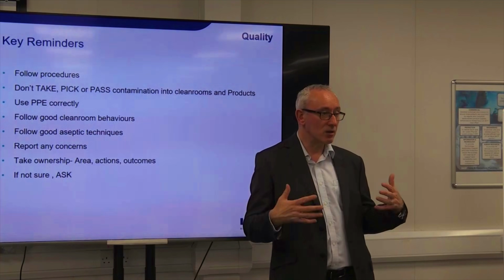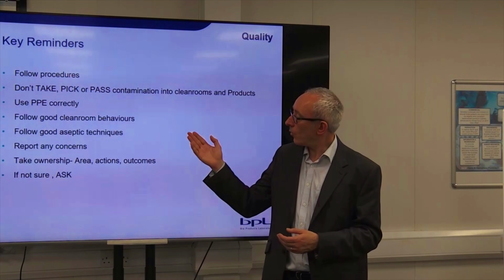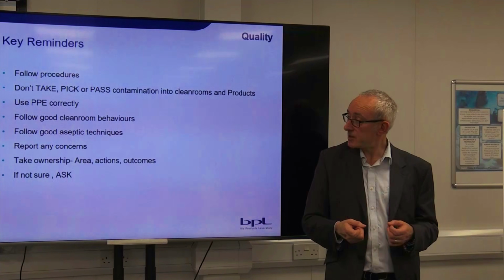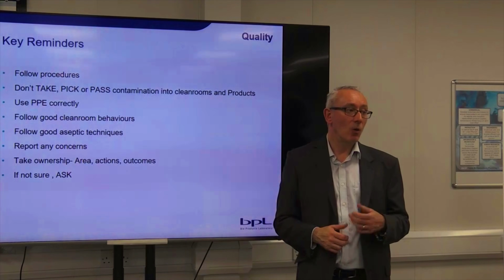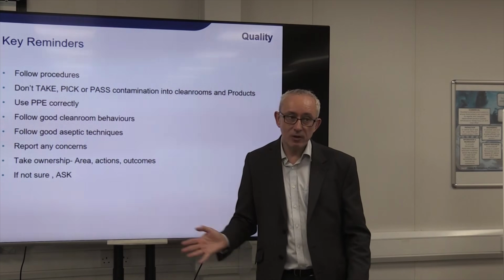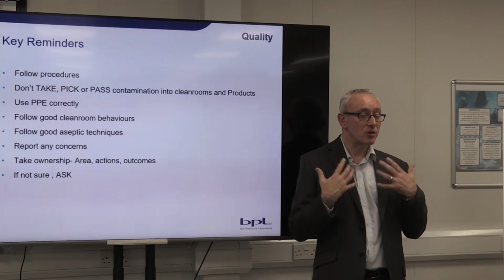Wear the gowns, masks, gloves, equipment and head covers correctly. Always move and work in the same way. Always follow good techniques to avoid cross-contamination. Report any concerns, so always flag things with your manager, and do what you can, because everything we can contribute as individuals helps to protect the patient.